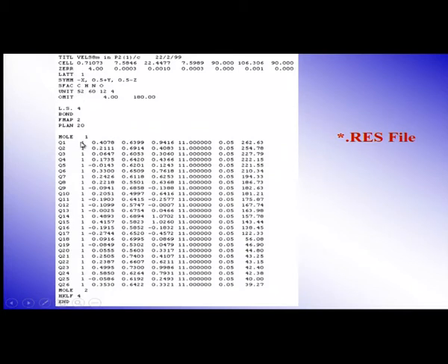If you look at the definition of structure factor, earlier we defined F of hkl equal to summation j equal to 1 to n, little fj atomic scattering factor, e power 2 pi i (h xj plus k yj plus l zj). So, for fj calculation we need some species. Here it assumes the molecule is made up of the same species of atoms, species 1, which is carbon. Okay, that is fine. Later on we are going to identify species. Three positions, x, y, z, it has found for one atom, second atom, like that.